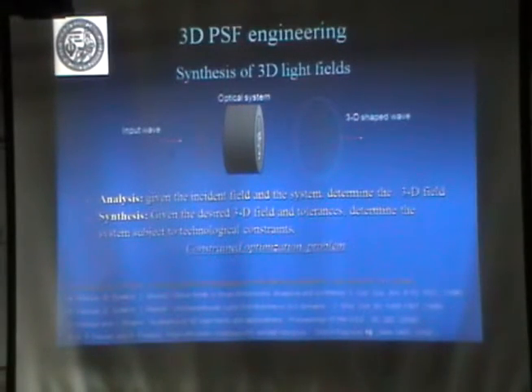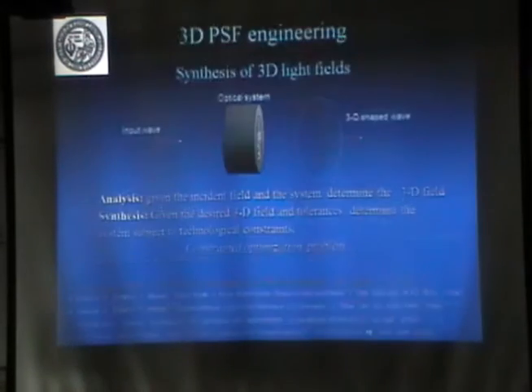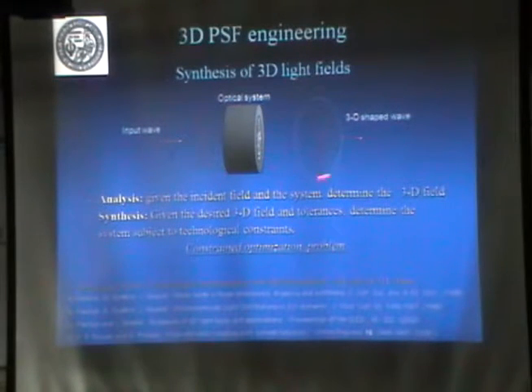So now I want to take you to the design, or how we explain these things. And yesterday I talked a little bit about that. We talked about this yesterday, about designing a 3D distribution. And you can look at this as, once you have a model for the optics, a constrained optimization.